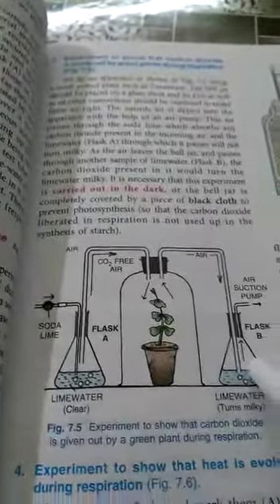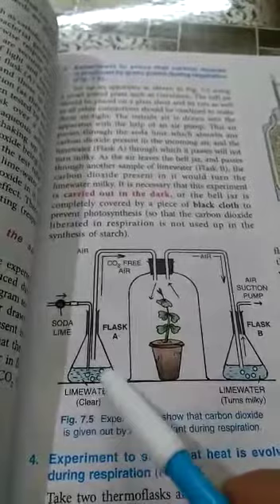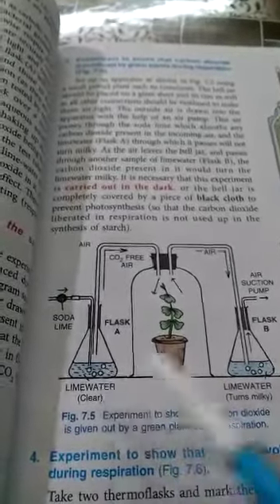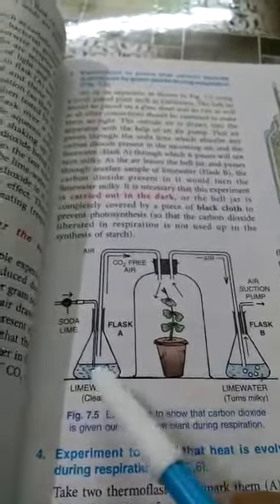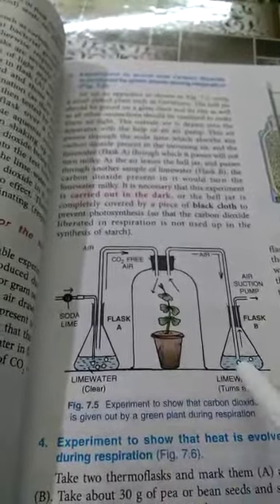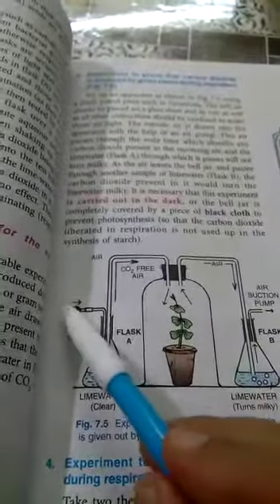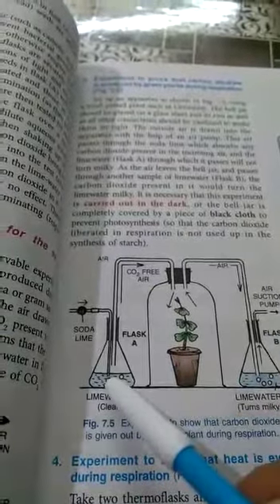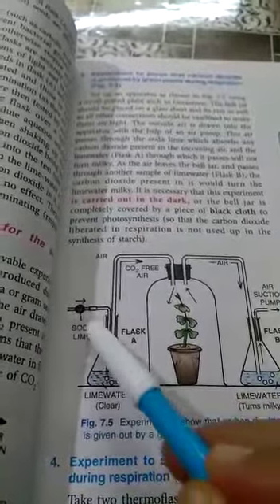We take two conical flasks here. This conical flask has lime water in it, and this conical flask also has lime water in it. So both conical flasks A and B contain lime water. Now, from here, the air will enter flask A. Here there is soda lime.